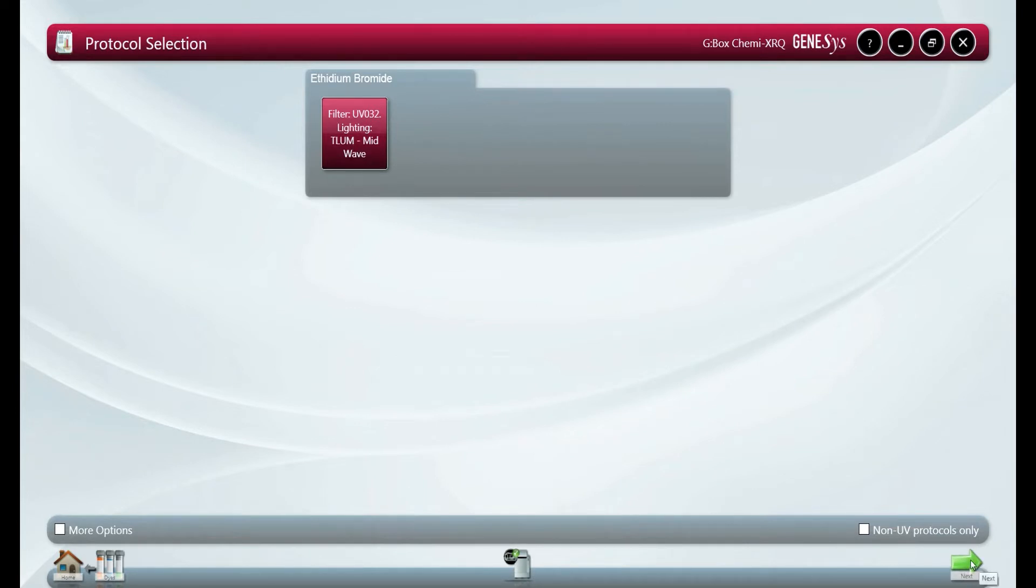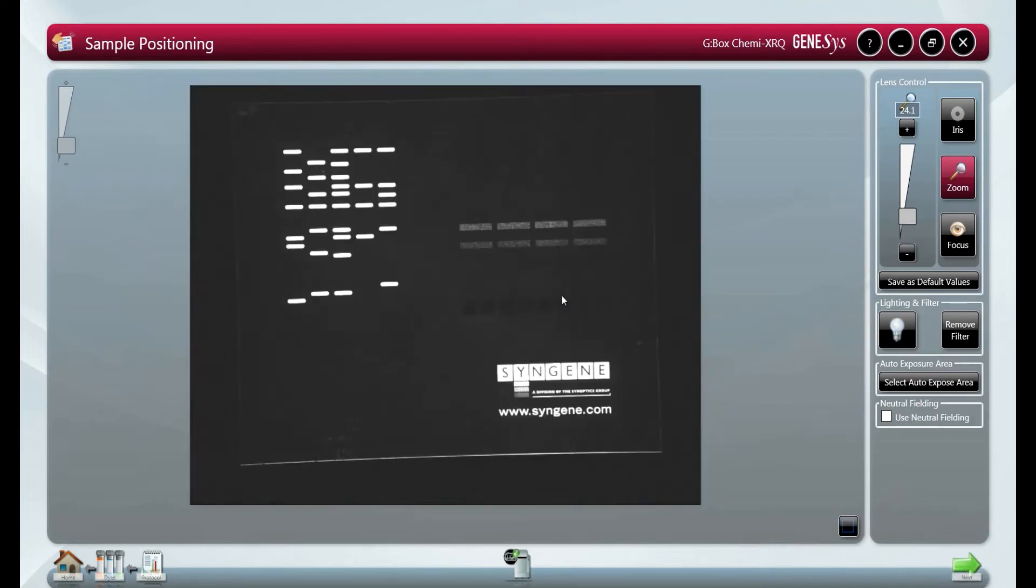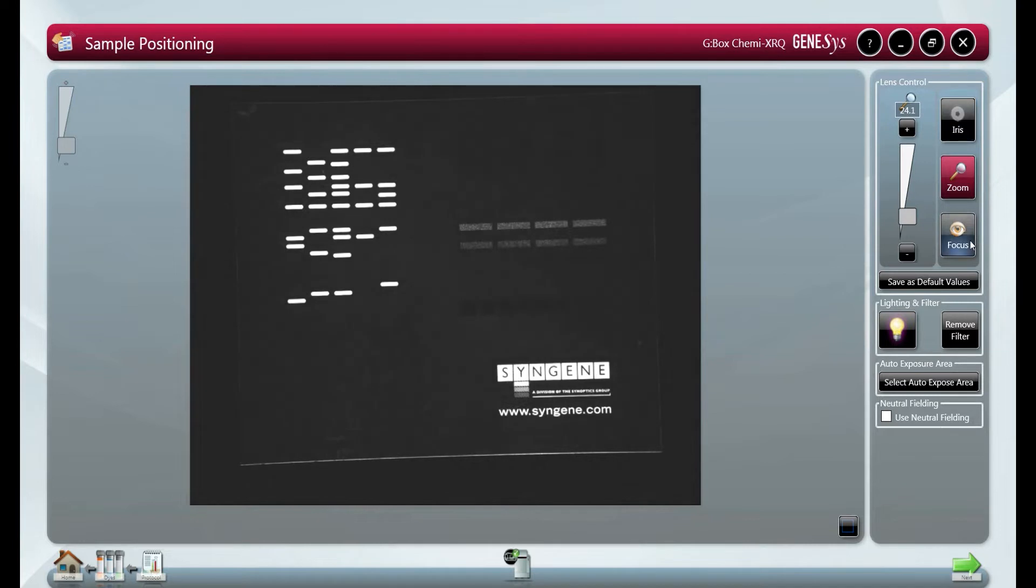Once all image capture parameters are defined we can make sure the gel is positioned correctly with the image preview. This gives you various options such as lens control, iris control, and zoom or focus.